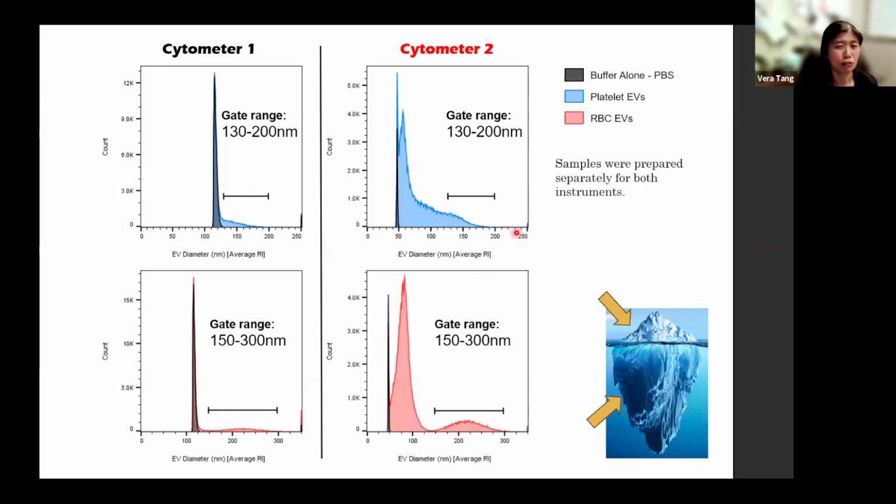You guys could probably tell visually that, oh my gosh, there's so many more events in here. Now, because there is a standard unit, I can actually set the gates in the exact same place. I like to say that you're providing people with GPS coordinates to find those events again. But by doing so, you can do direct comparison between cytometers, between times, between very different cytometers as well.